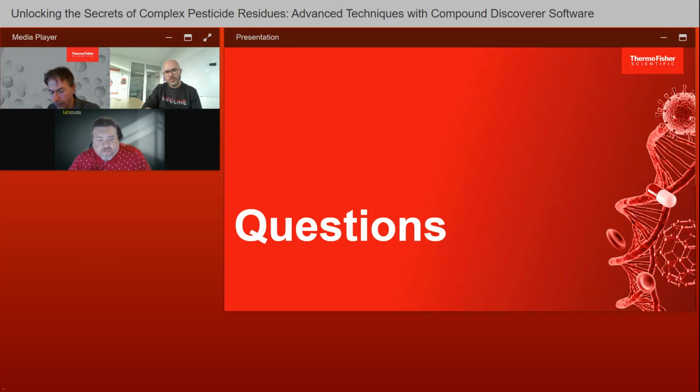Also a good question. That is actually optional. So there were a couple options that you can choose in the component assembly node. Per default, it will try to use the online version of MZ Cloud, but it's also possible to basically only use the fragments from the MS2 data. It will try to look for fragments that are present in the fragmentation data, and if at the same time we also see these peaks in the full scan, right, then it will detect those as in-source fragments.